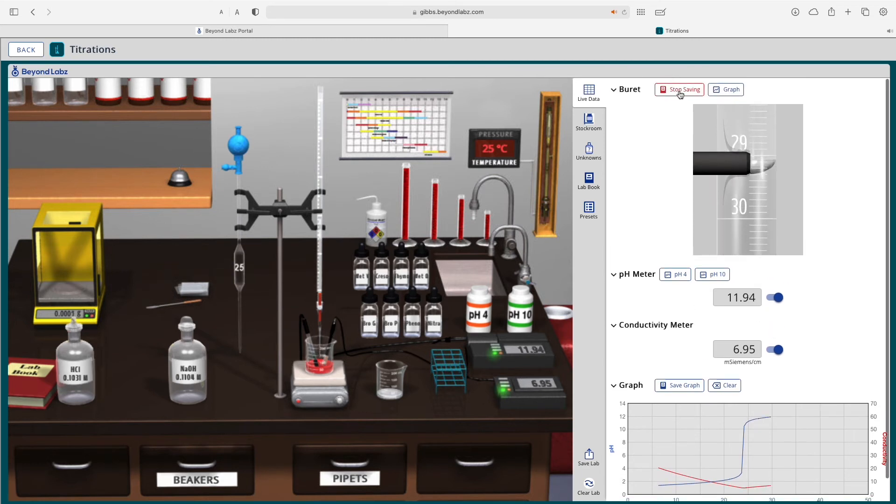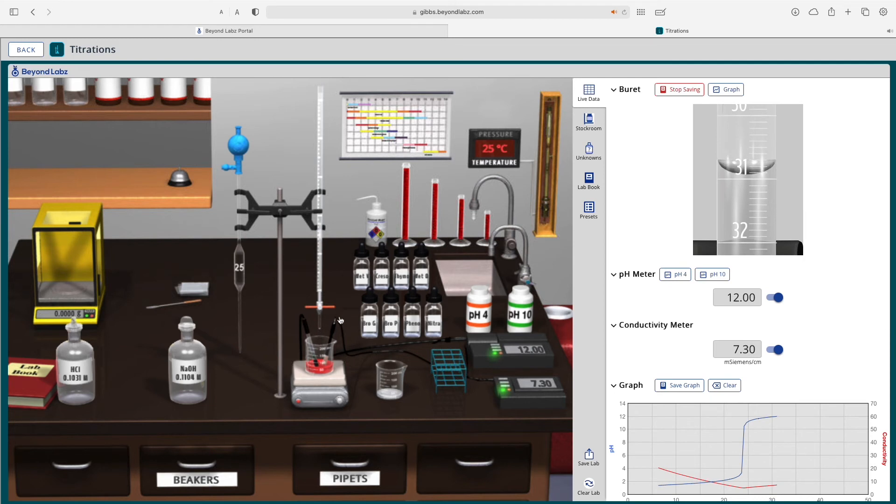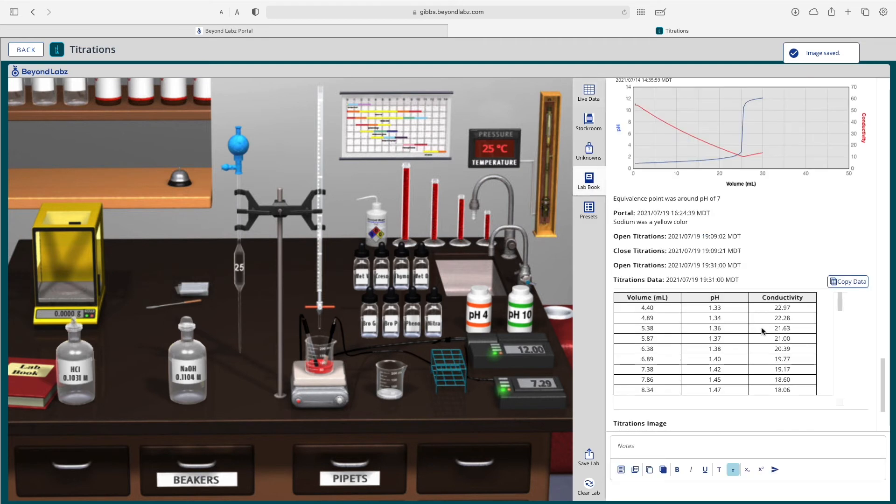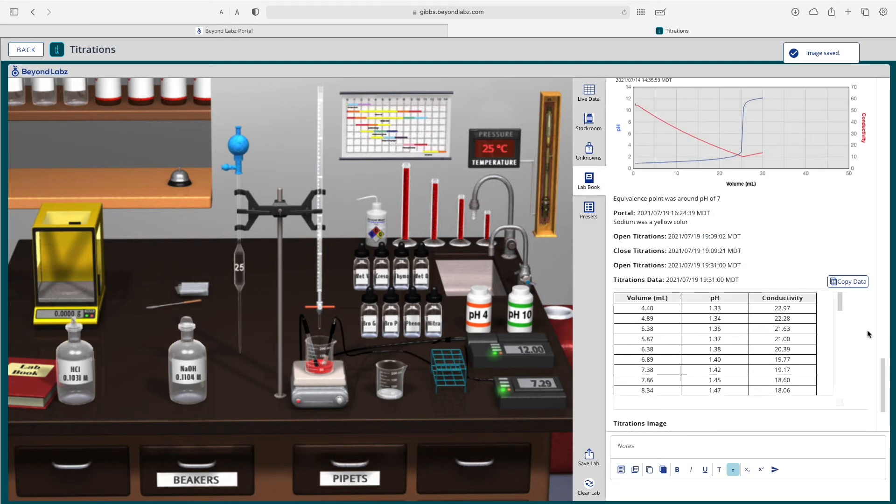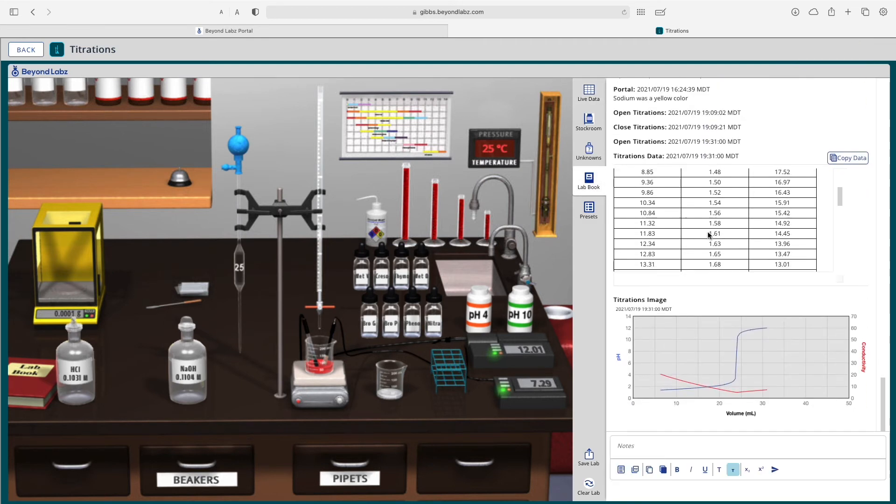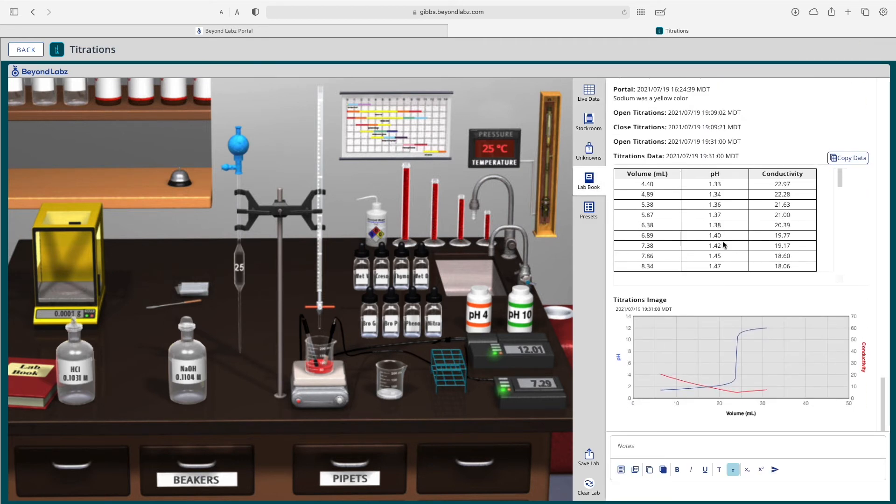So once we're ready we can stop by adjusting the burette, we can stop saving the data and then we can save our graph and all of that information will be viewable in our lab book screen.